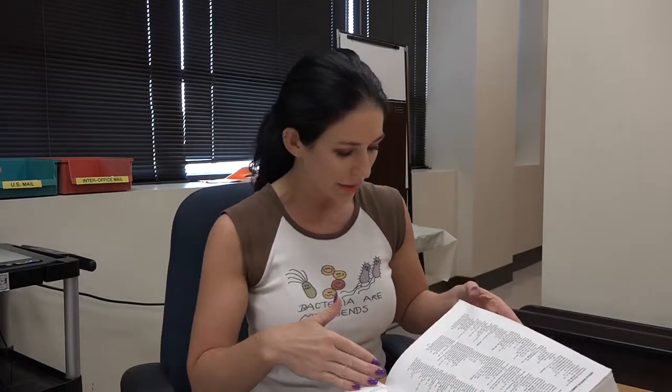The nice thing about the determinative manual, there's only one volume. You just need to go to the index to look up your bacterium. So I've pre-marked mine, but you can go through alphabetically. I'm scanning through and I found the genus Proteus. You'll see a lot of different numbers. You want to focus on the bold number. This one says 184. Again, I've pre-marked mine, but you can come back and find wherever you're looking. Under 184, there we go.